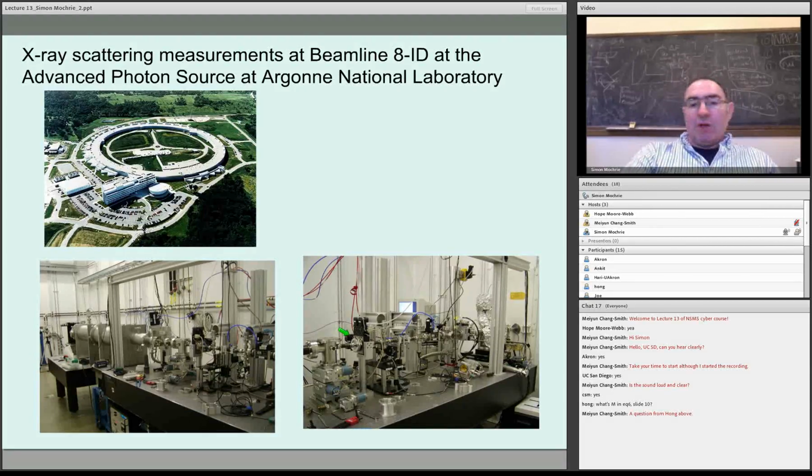So this is looking towards the synchrotron. If you turn around through 90 degrees and walk a couple of steps towards the synchrotron to here, and then look back out towards the beamline, this is what you see. This little tube that I'm indicating with my arrows is the path of the X-ray beam.